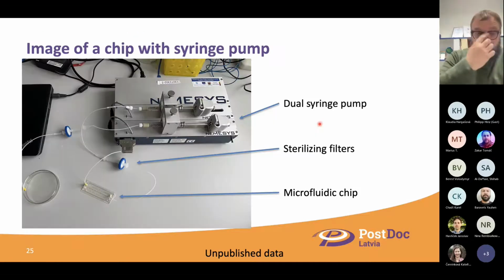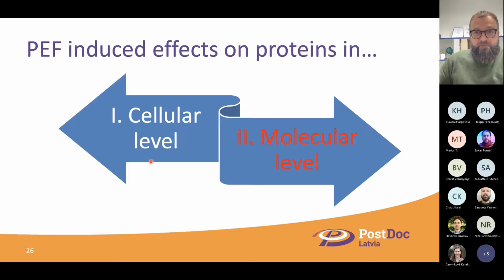And yeah, going into real things, not models. This is what the chip looks like. Actually, here there are no electrodes yet, but still, the system looks like this. It's quite a small device. Of course, there is a lot of stuff around it, and sometimes the setup is much bigger.